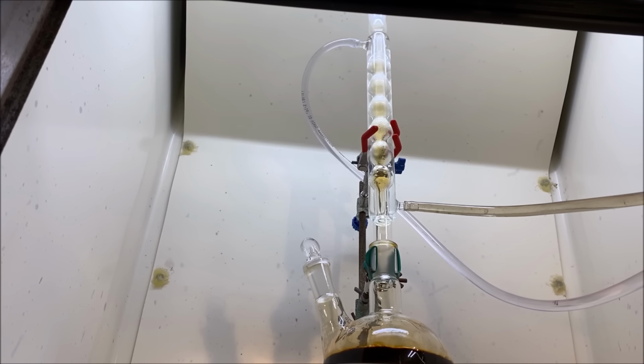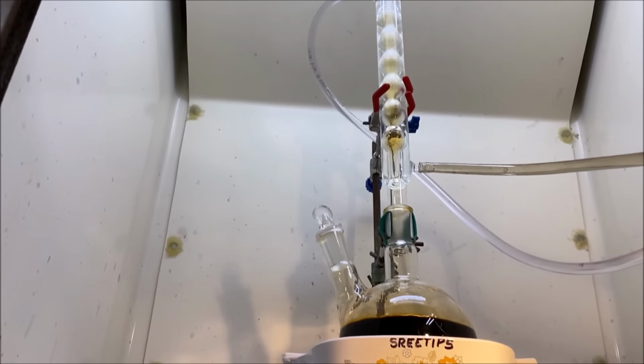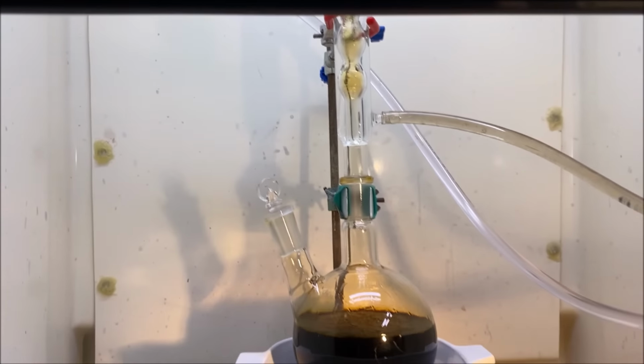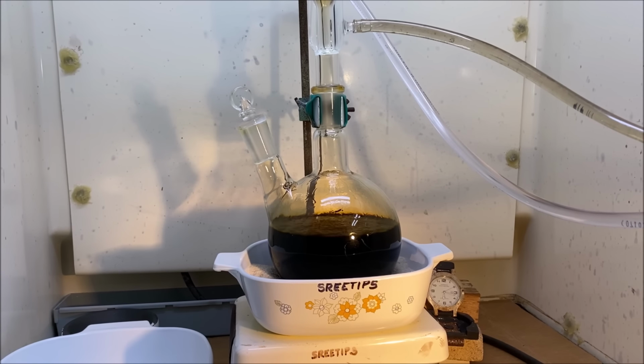As you can see, I've had this on refluxing for a good 12 hours now. Still got a little bit of fumage going on. But I think what we're going to do now is go ahead and turn the heat off and let this cool down and see what we got going on inside that flask.